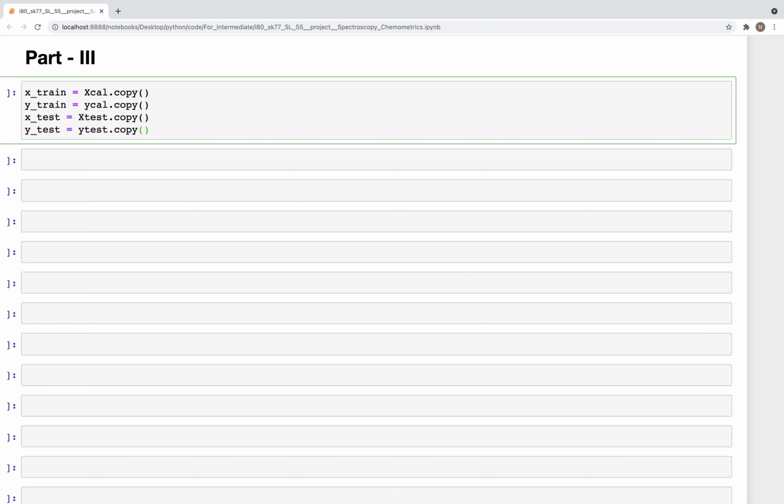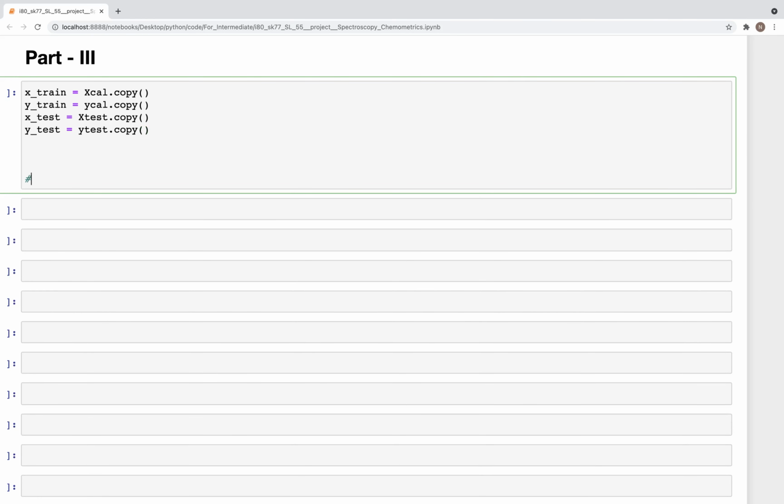Okay. So with this, the next step is to zero out low values. So the reason why, let's leave this as is, and I'll come back to this later on. So I'll put the heading and write the code for this later on. The low values.